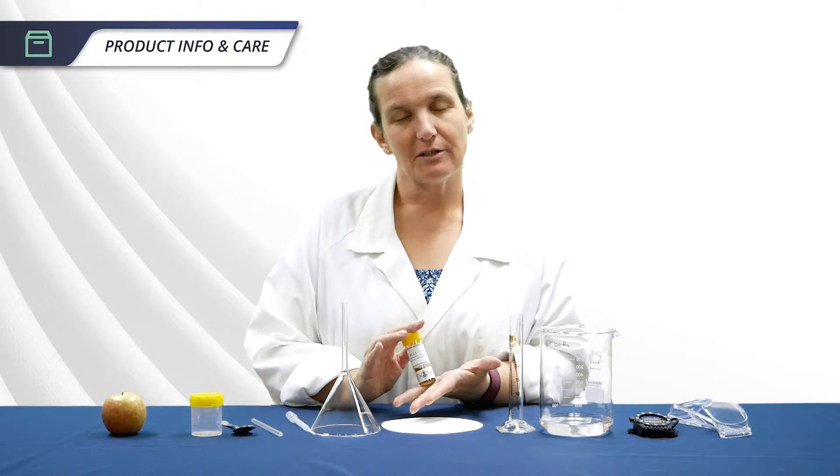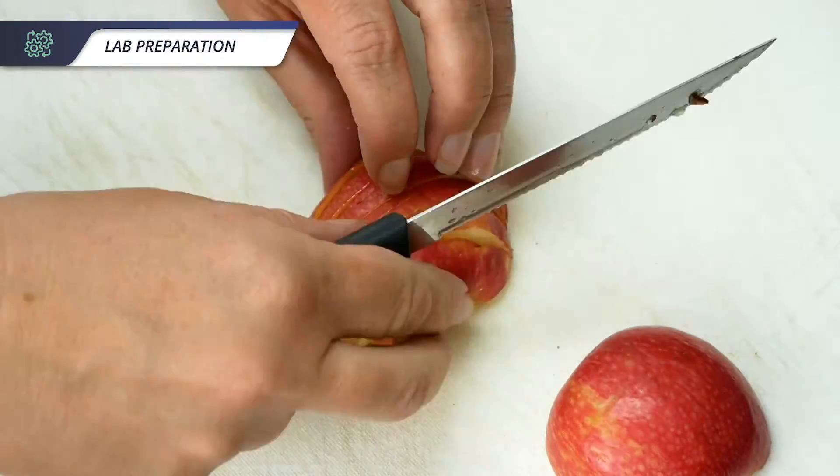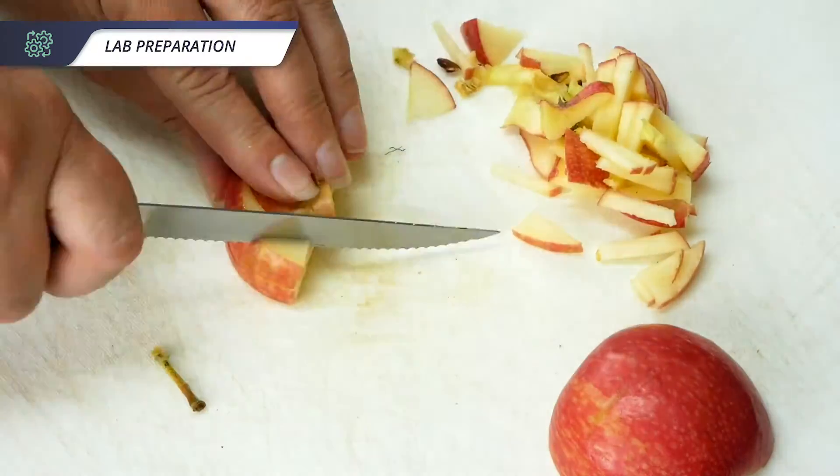Our enzymes are usually kept in the fridge and will last about a year after purchase. To prepare for this activity, cut the apple into small pieces — around two to five millimetre cubes — using the whole apple including core and peel.